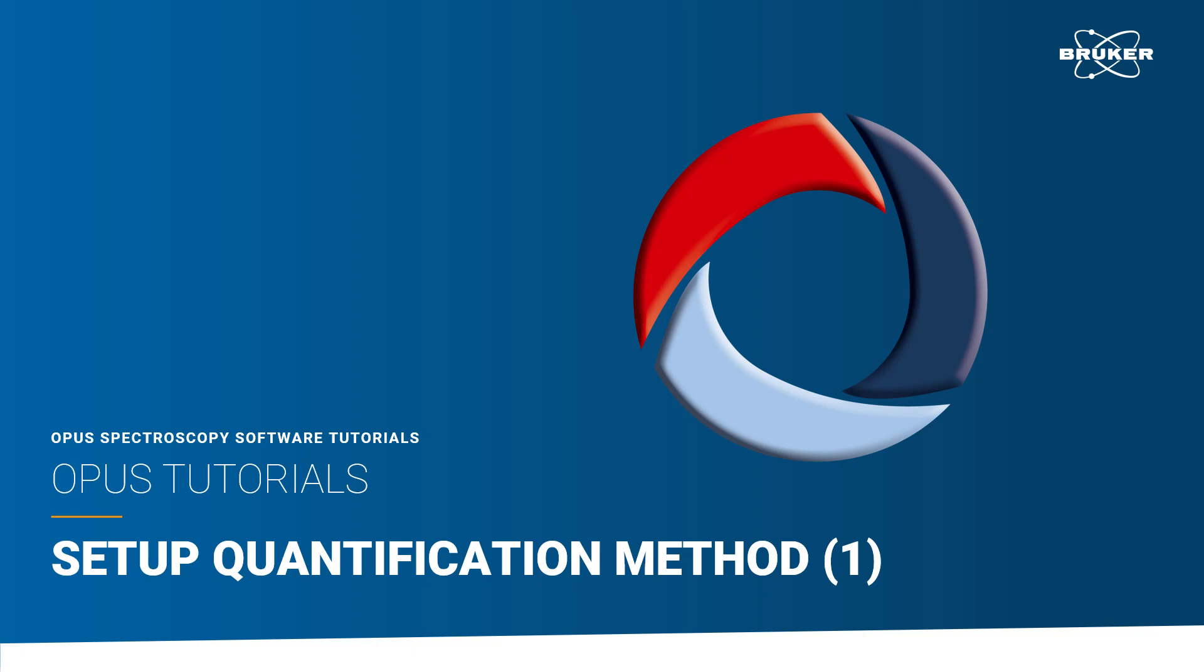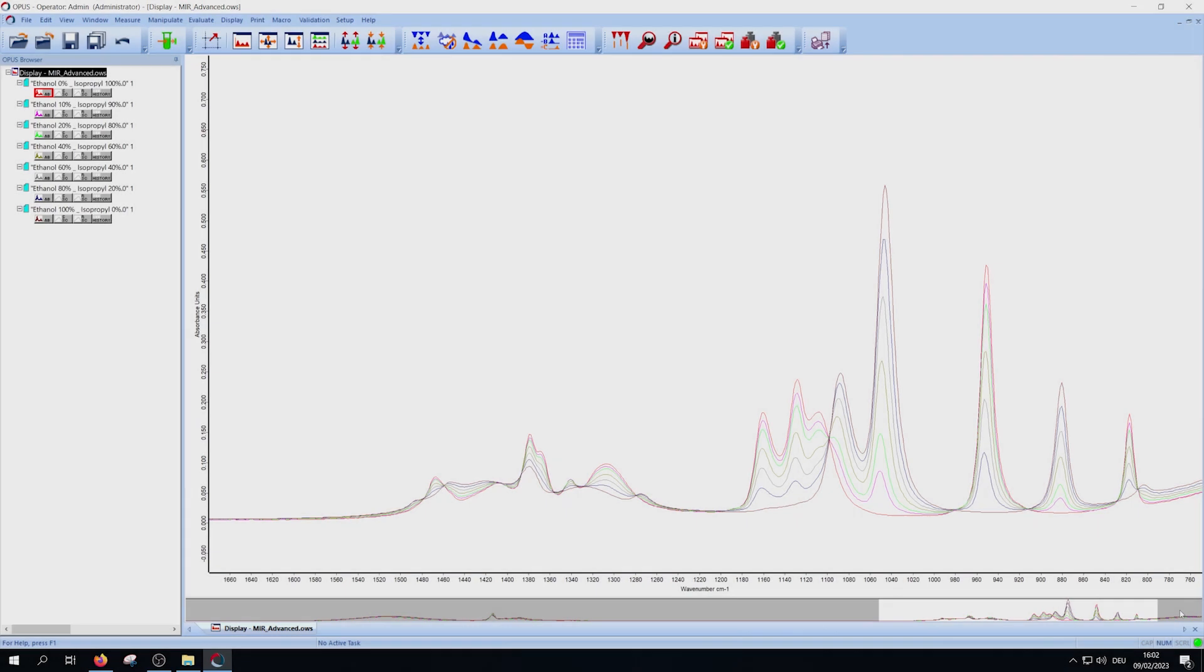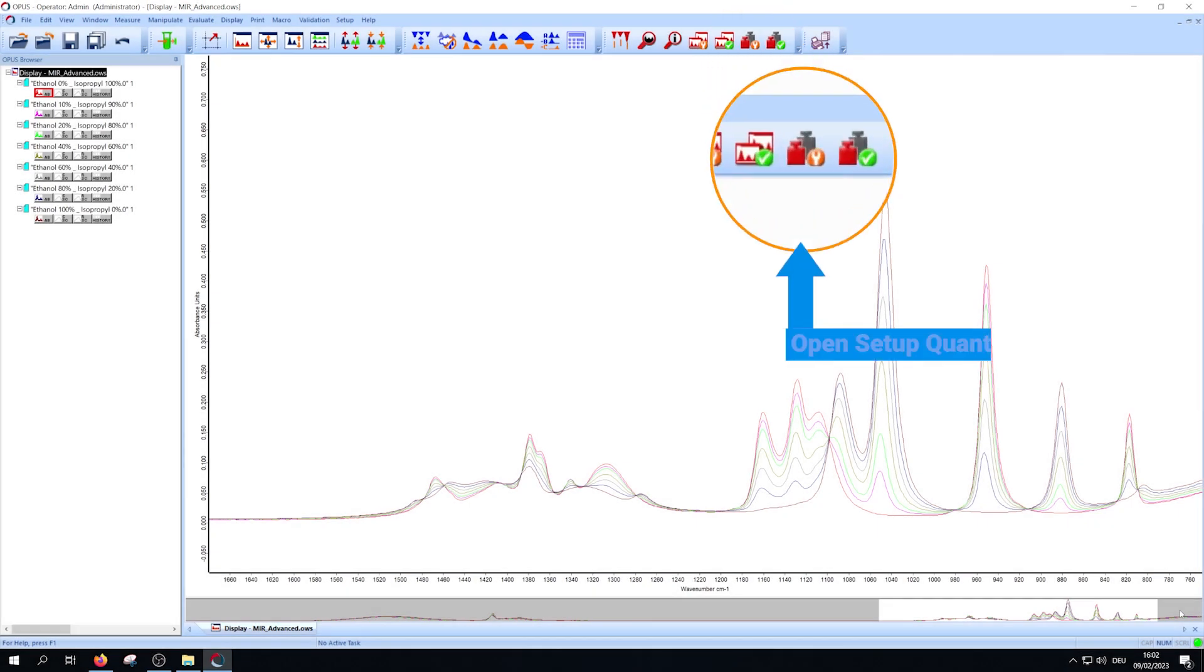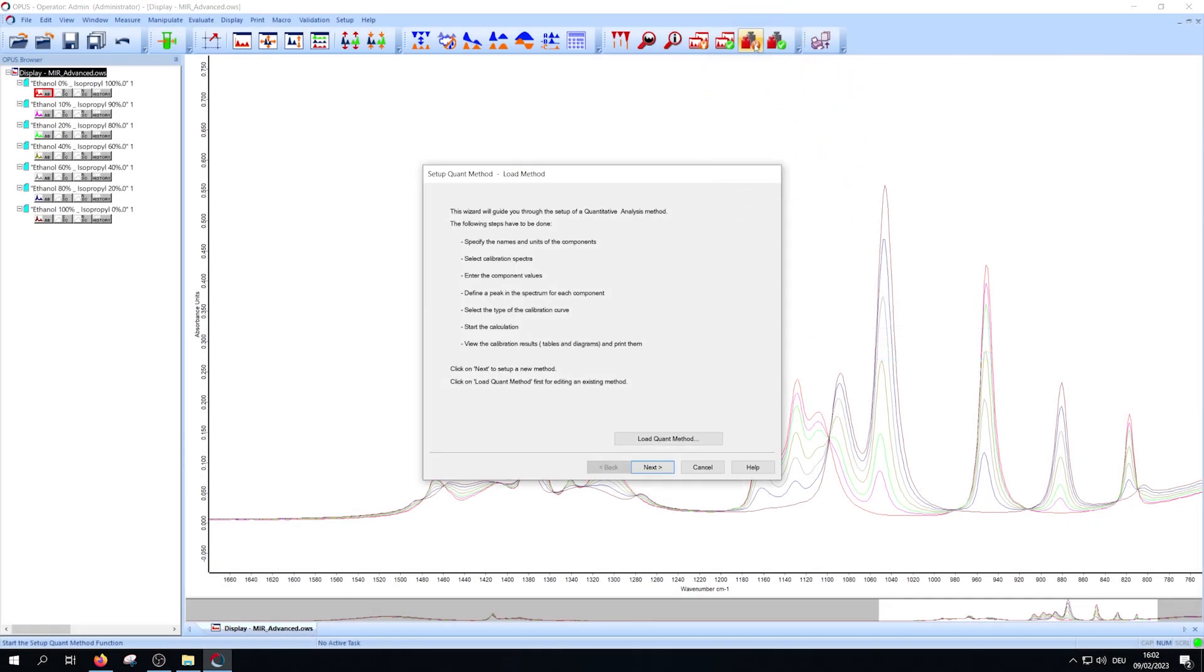Hello and welcome to this tutorial about the setup of the method Quant. First you have to open SetupQuant. You will get a quick overview of the setup steps.